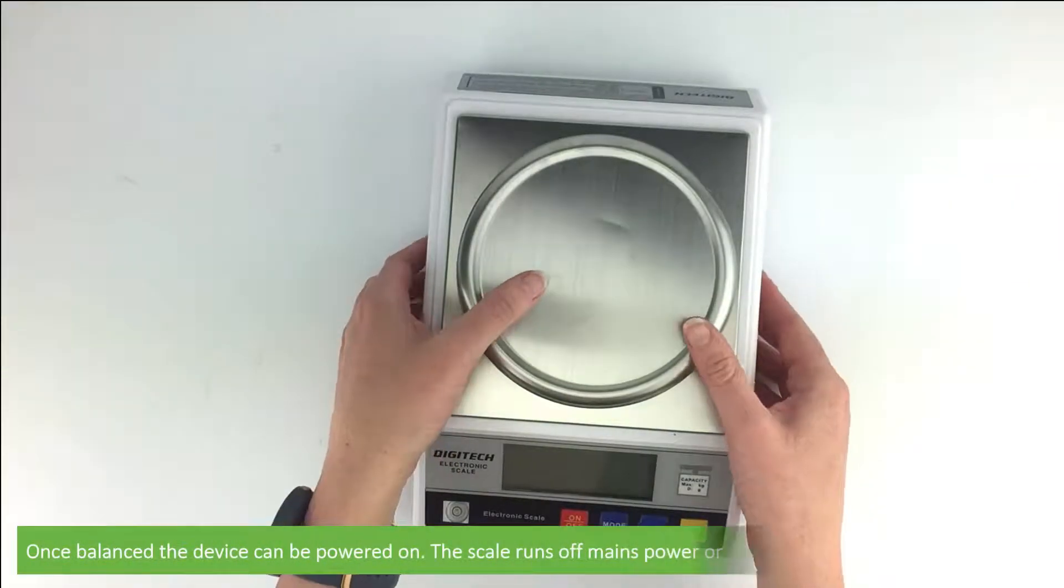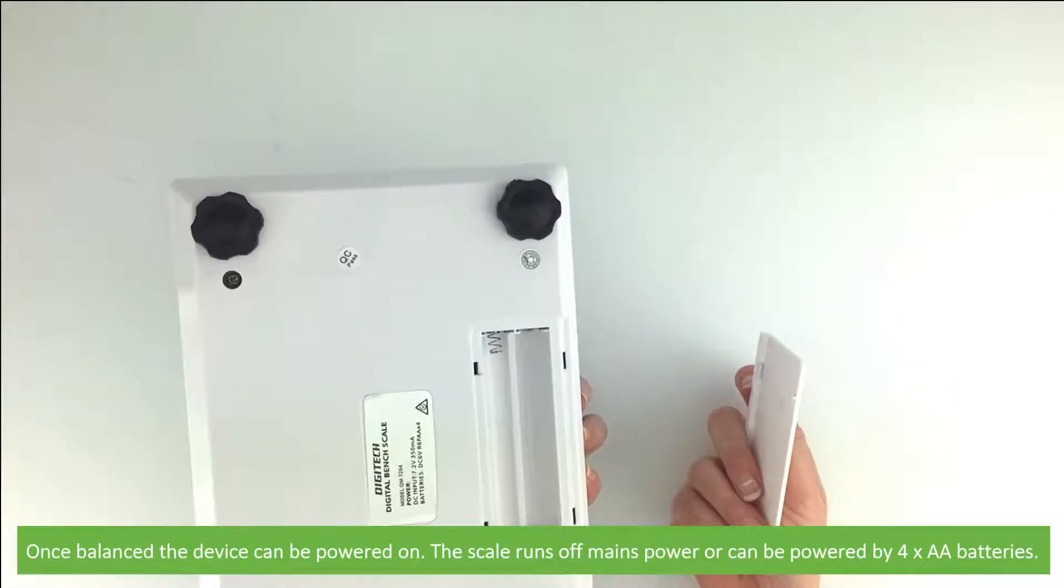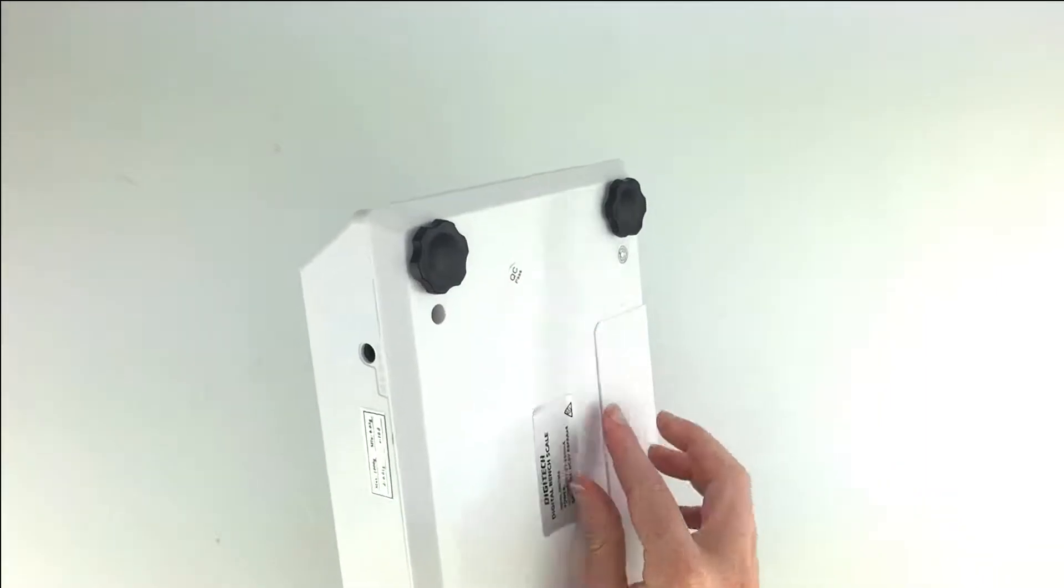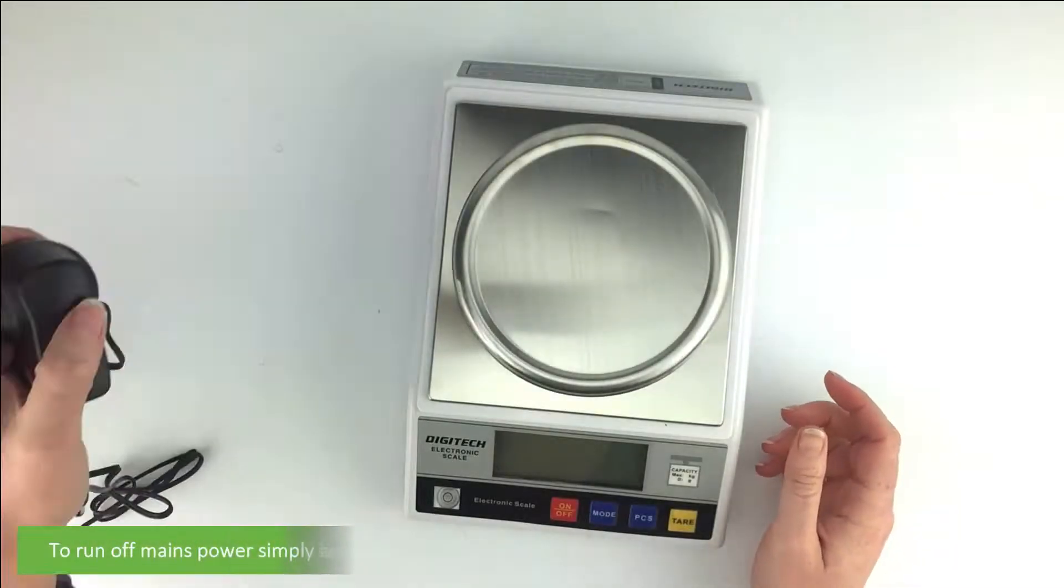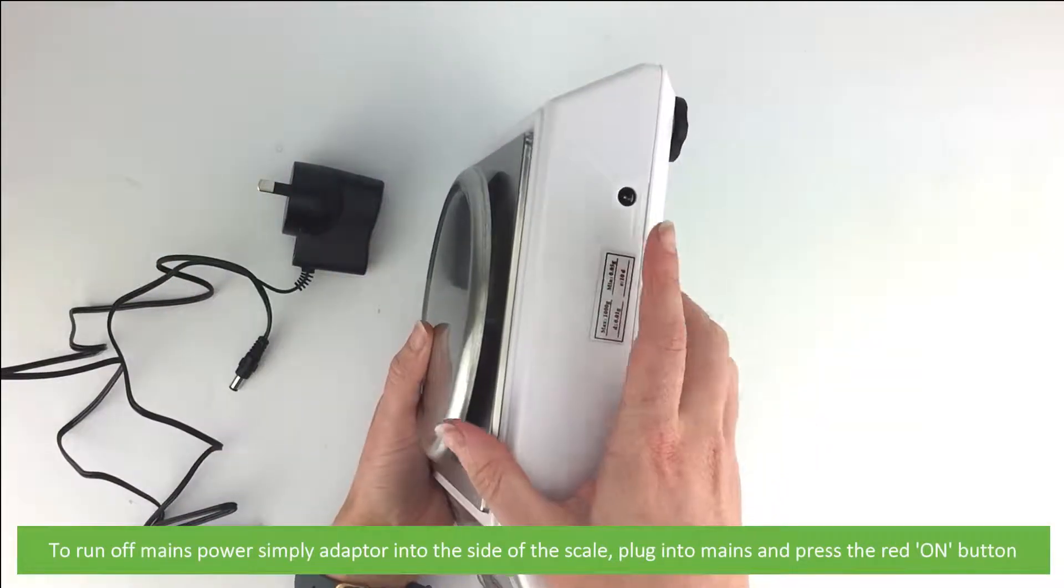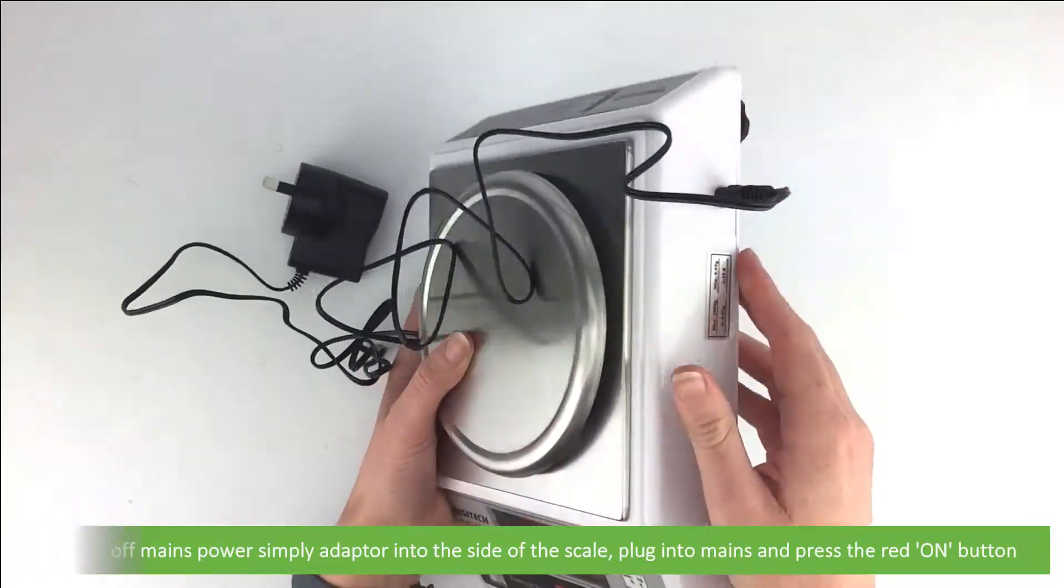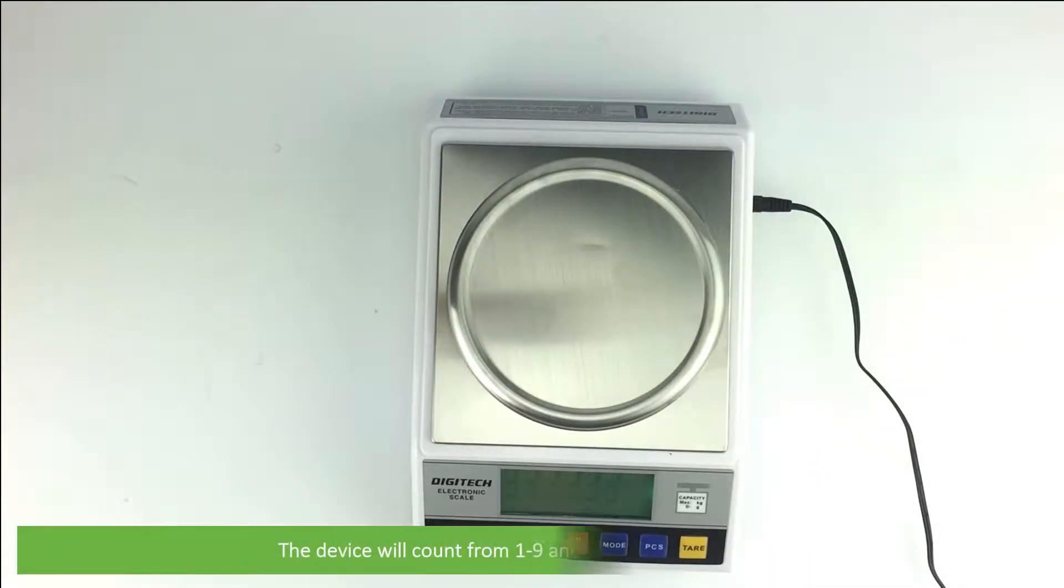Once balanced, the device can be powered on. The scale runs off mains power or can be powered by four double-A batteries. To run off mains, simply plug the adapter into the side of the scale and press the red on button. The device will count from one to nine, and then it's ready for use.